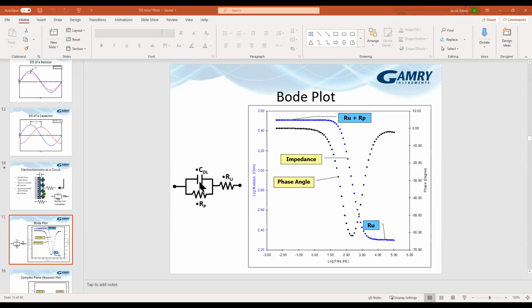So what happens is if you have an incredibly large impedance here and a much smaller impedance here, and you put them in parallel with each other, this one becomes inconsequential. And so that's what's happened here. Once you get up to these lower frequencies, you can see that the phase is affected because this is a log plot. You can see that this seems to come up and level off before the phase, but that's because it's log on the modulus side. So the capacitance is still a contributing factor up until it levels out to the 0 degrees phase.